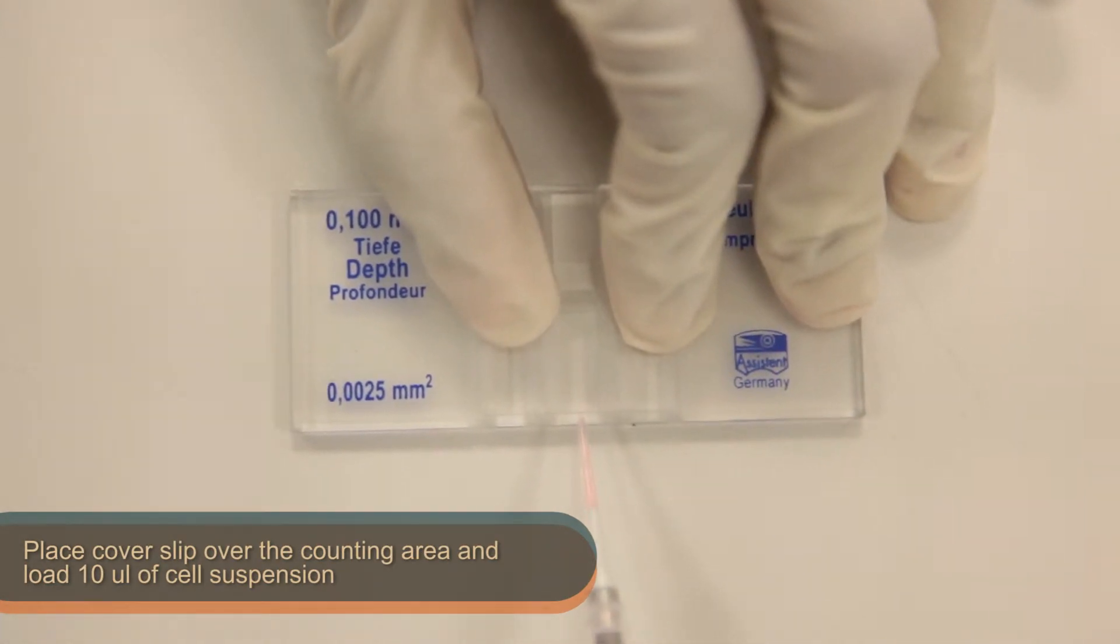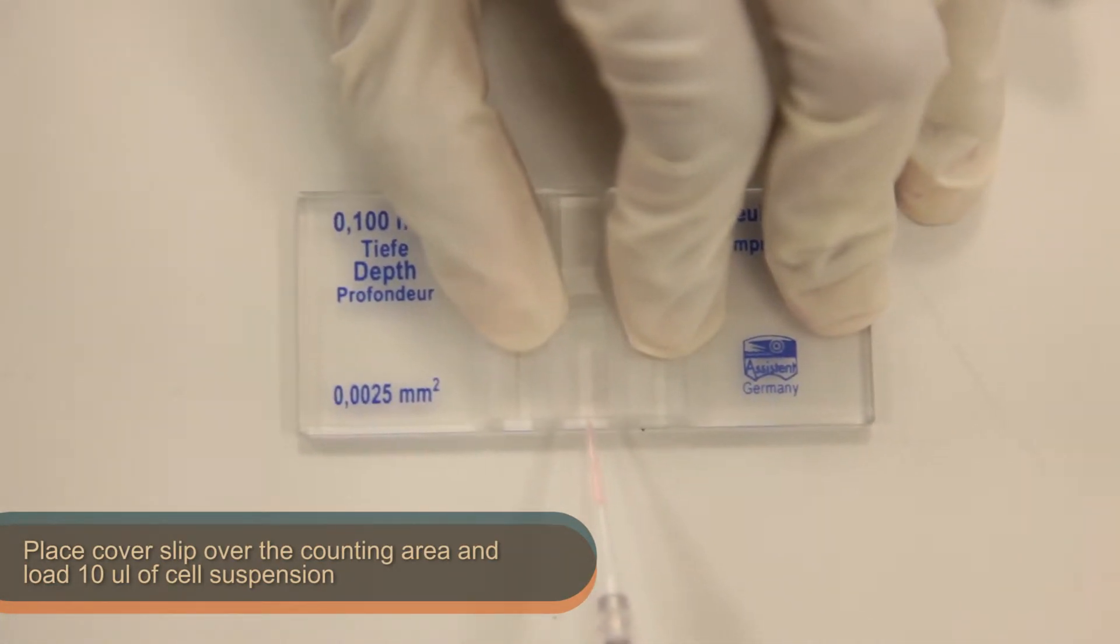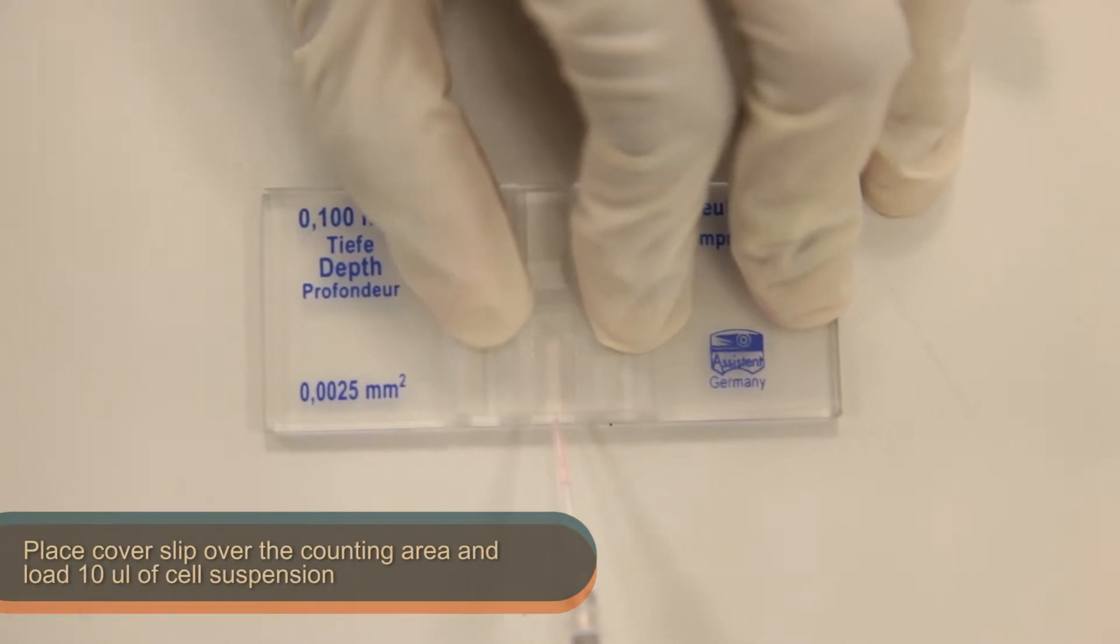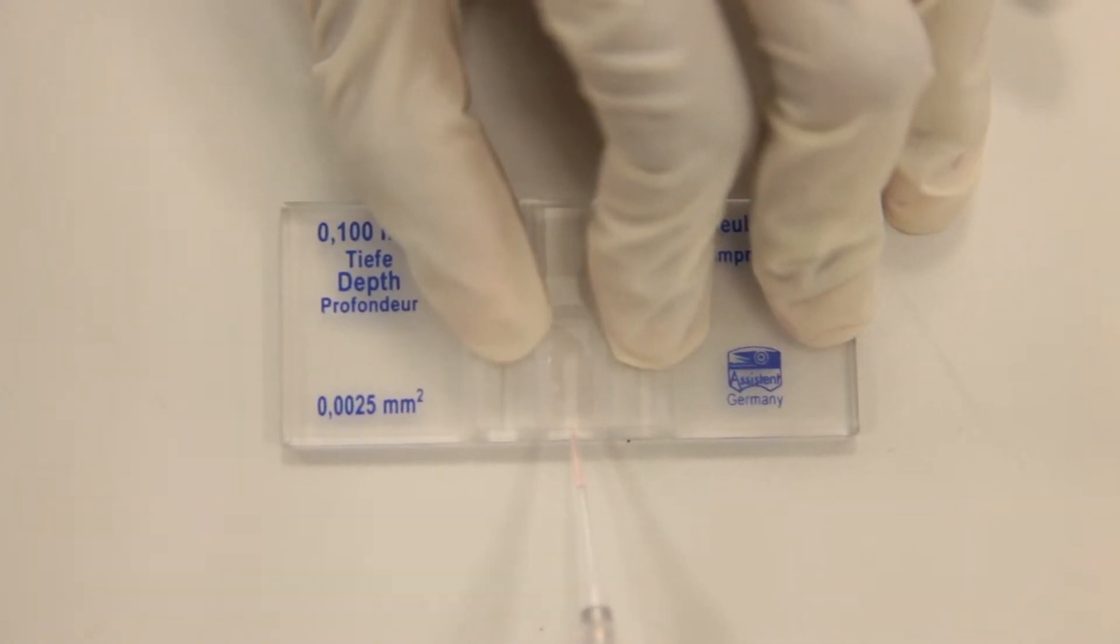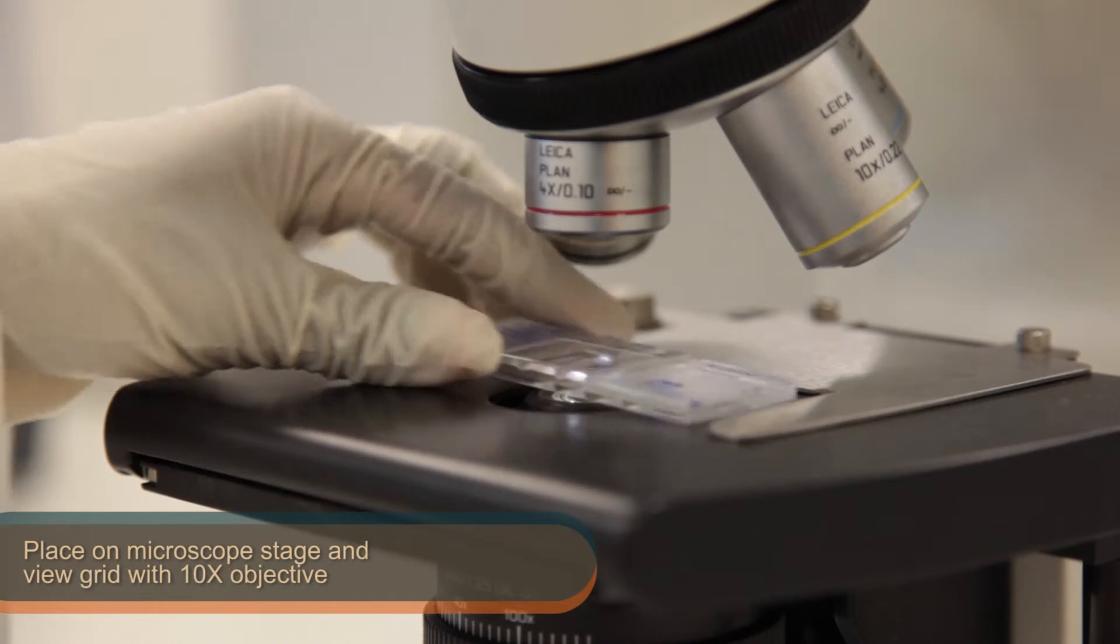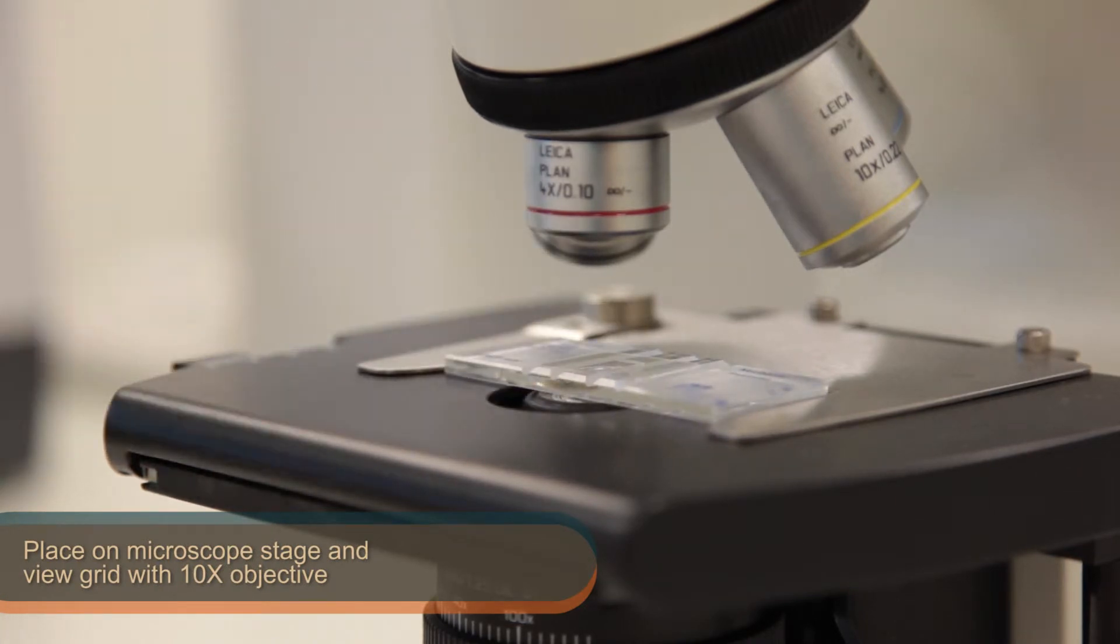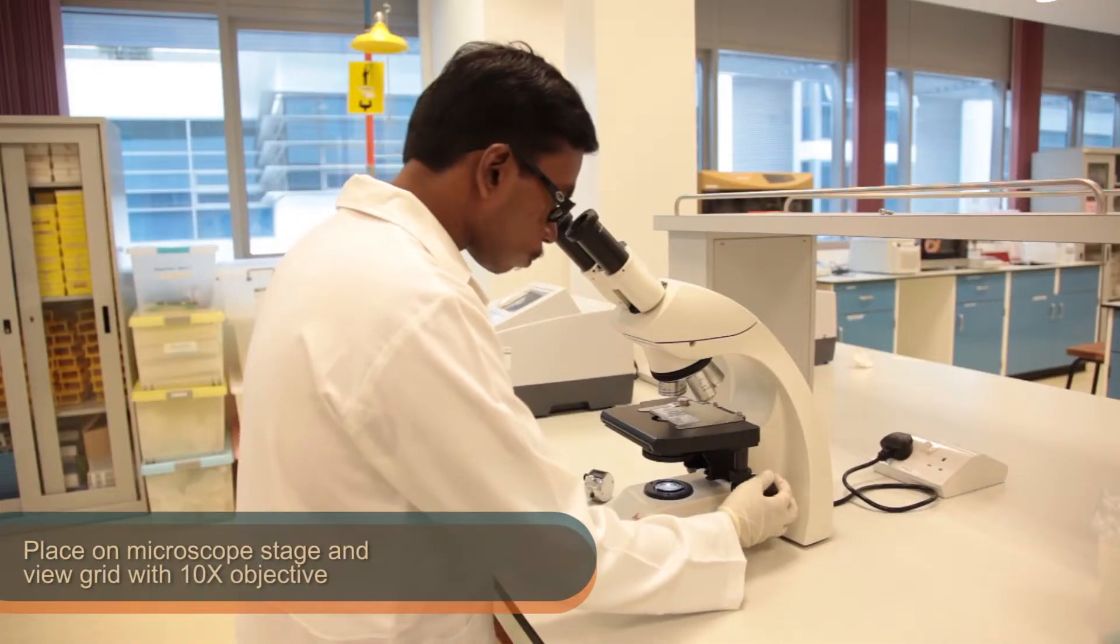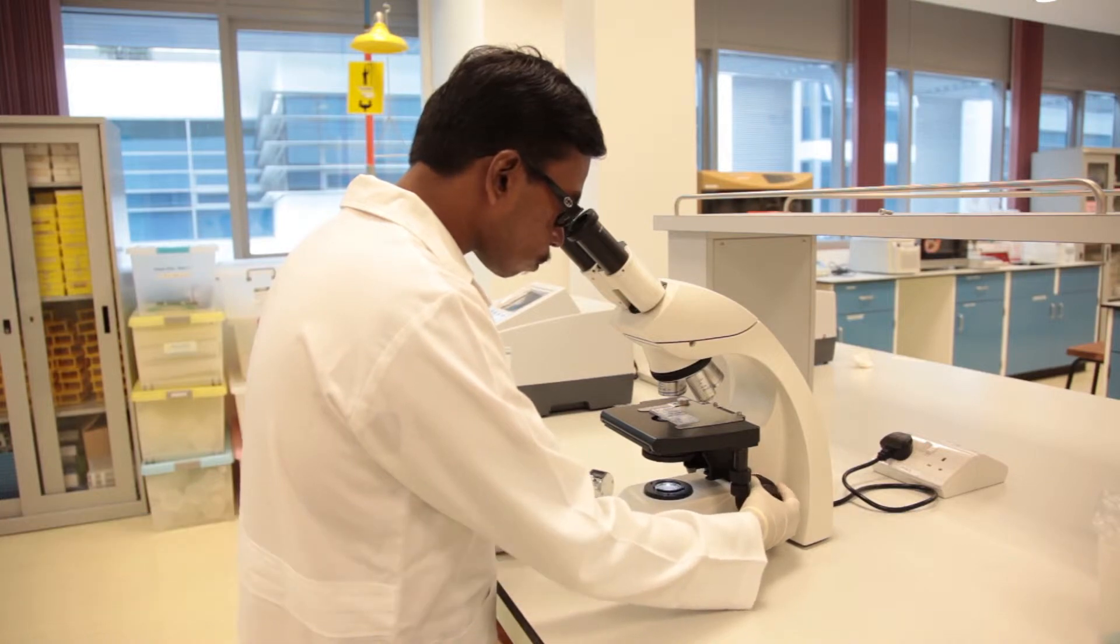Make sure the cells are maintained in ice. Then, place the hemocytometer on the microscope stage and view the counting grid with a 10x objective.